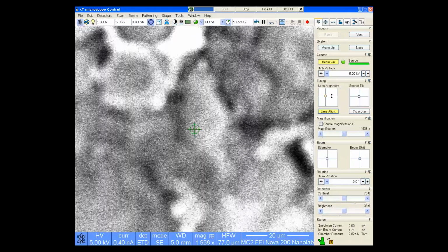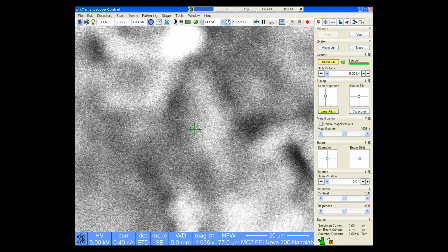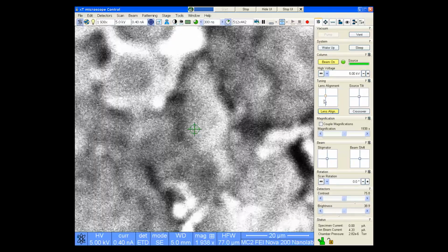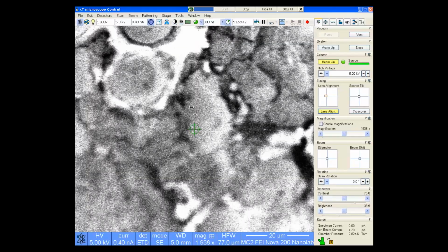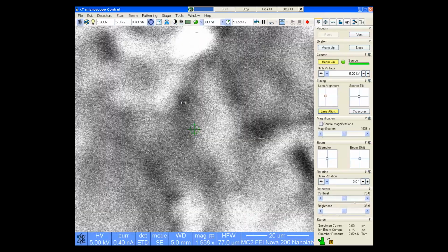Usually this procedure has to be iterated several times. So now by removing the vertical wobble, I now have a little bit of horizontal wobble again. So I'm going to go back and move the vertical line left and right and try to minimize the rest of that wobble.